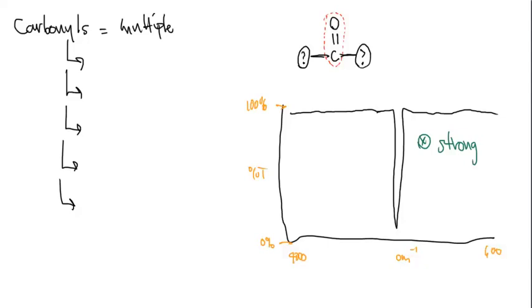We use the same word to describe an alcohol peak. Now, the alcohol peak was described as broad, which means very wide. This one is not broad. This one is not traditionally a very wide peak on the infrared. But they don't call it narrow either, because it can fluctuate back and forth.